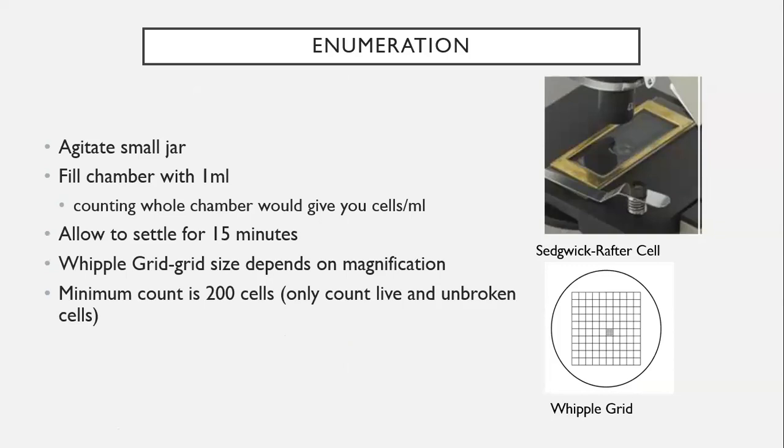There's a lot more you see in these rivers, and hopefully we can do another presentation where I give you a closer look and you can practice some identification. The other half of this analysis is the enumeration. So we not only identify, we want to count how many of each of these organisms we see.